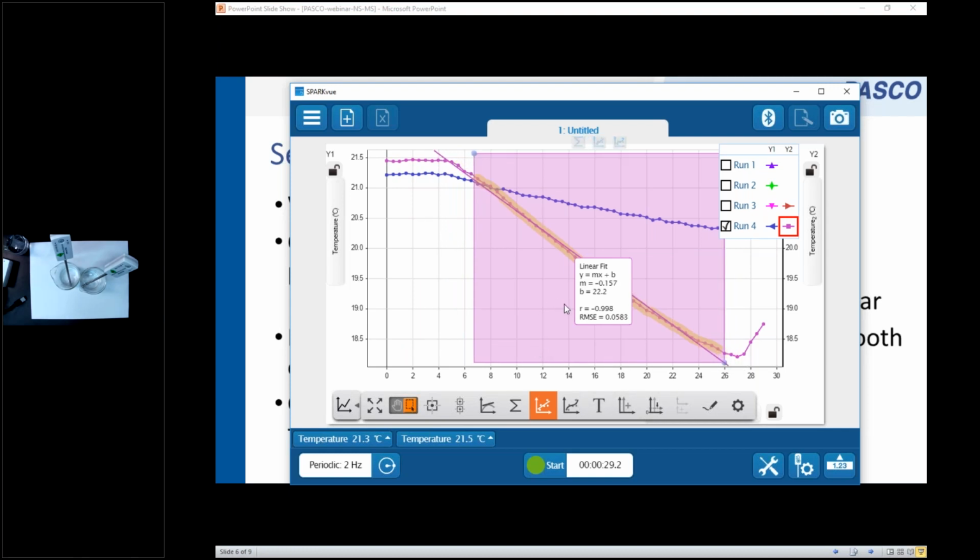If I want to know maybe just the change in temperature or just the change in time, I can use a coordinate tool button. That button is right here. It's the third button in. If I click it, it tells me the information for just one point of data, and I can pick up the square that it's pointing to and move it up or down, and it'll tell me at an instant what is the time and temperature.